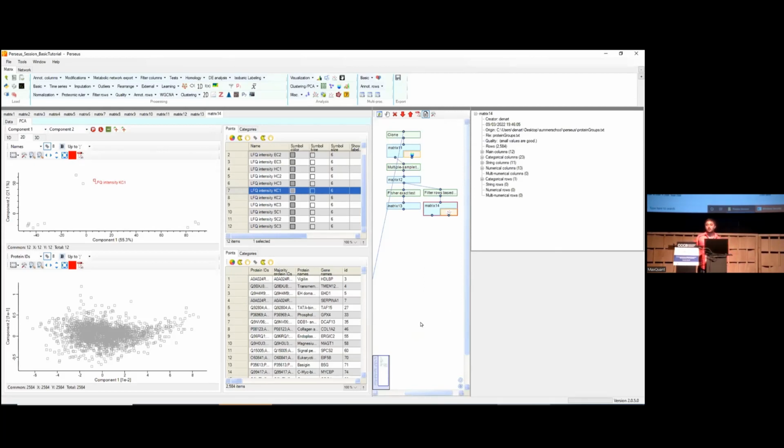Yeah. No, if you can further explain the above, the down graph, because the first one I understand, but the second one I didn't understand. Sorry. Okay. Yeah, sure, no problem.